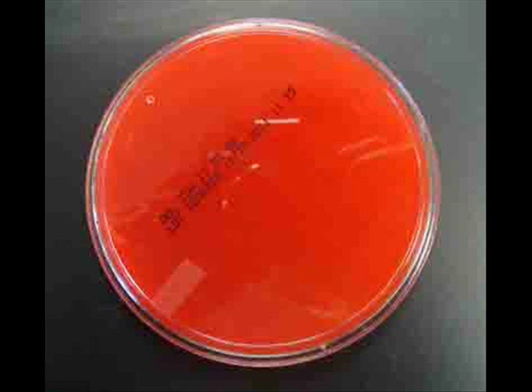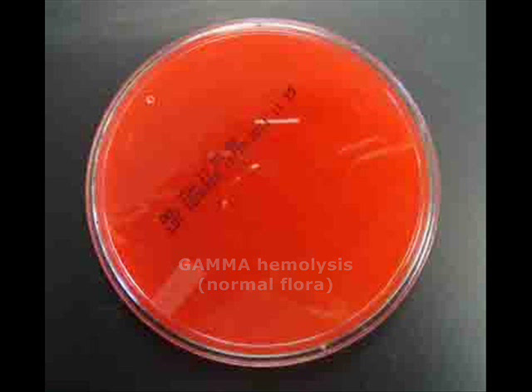Here's the bottom of a blood agar plate, and although there was growth on the top portion, when I flip that plate over and look at the underside I can see that the medium has not changed at all. It looks as if it were a brand new plate of blood agar. This means the bacteria growing there do not produce hemolytic enzymes, so this is gamma hemolysis, indicating normal flora.